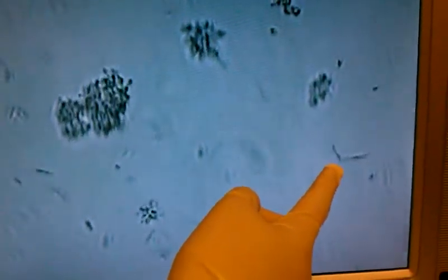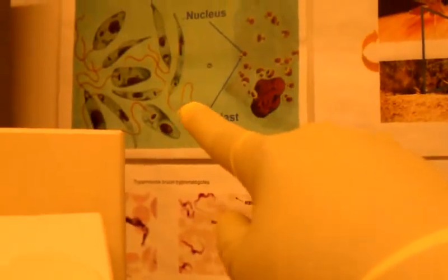And they move really fast, and they don't like to grow single like maybe these ones, so they join in with these. See how they keep on getting closer and migrating. And this one right here is trying to split. Because parasites, you know, they're asexual reproduction, so they grow continuously. So you see how they get close. Eventually, their flagellas, which are the tails on the ends of these, get tangled all together, which forms these rosettes. And you see, it's really densely populated.